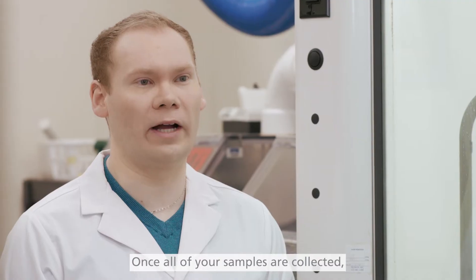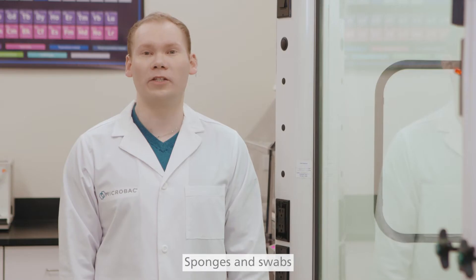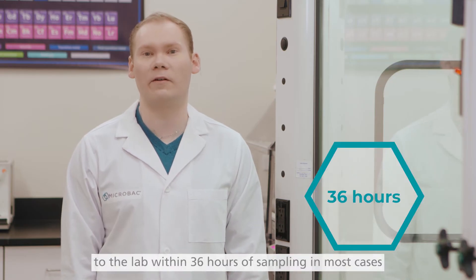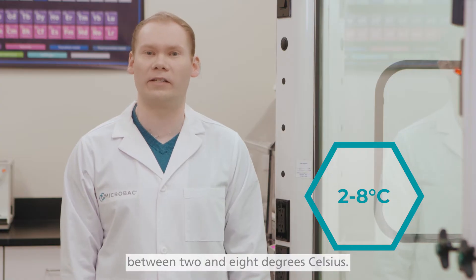Once all of your samples are collected, proceed to filling out your submission form and packing the samples. Sponges and swabs should be received to the lab within 36 hours of sampling in most cases, and should be received between 2 and 8 degrees Celsius.